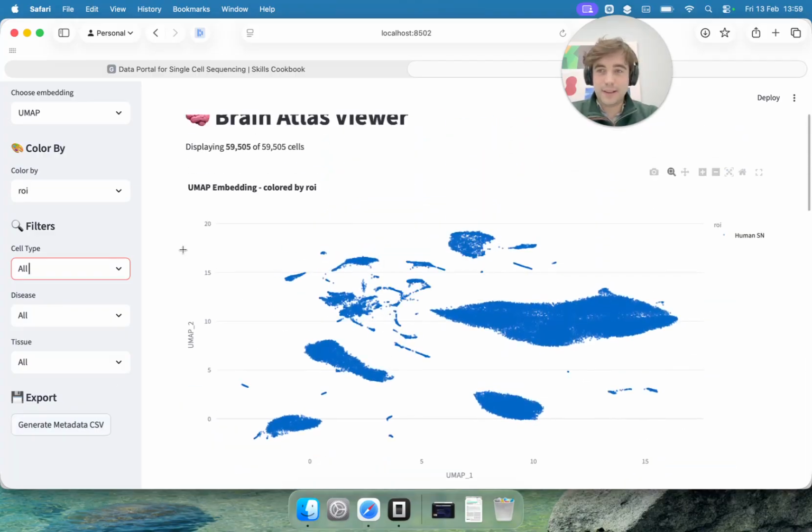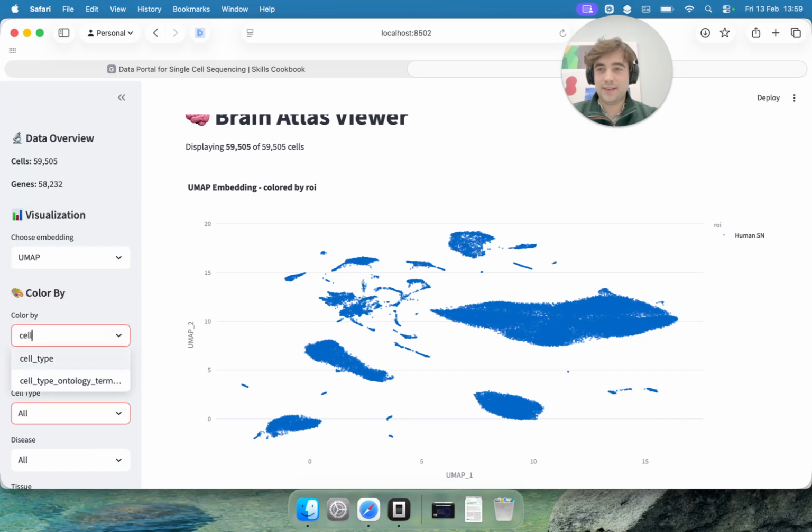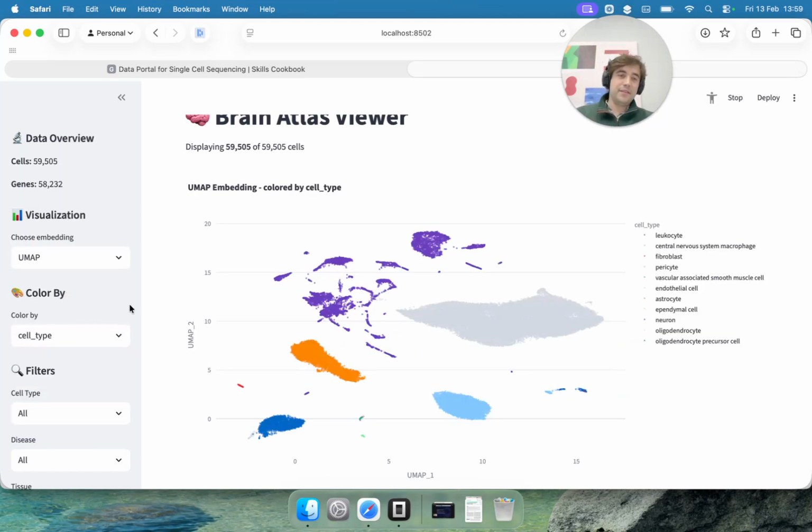So this is a really powerful way to just start exploring your data, like a cell type, and instead of having to go to an external interface or go through your code, you can quickly chop one of these together in 10 minutes and explore. And we'll next look at how to save and maybe add it to GitHub if you want to share it with other folks.